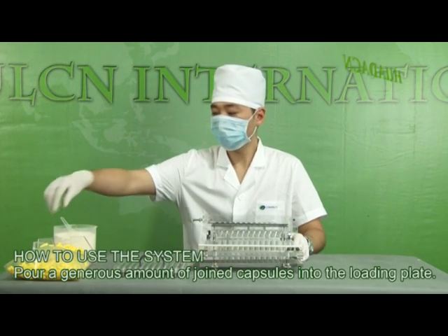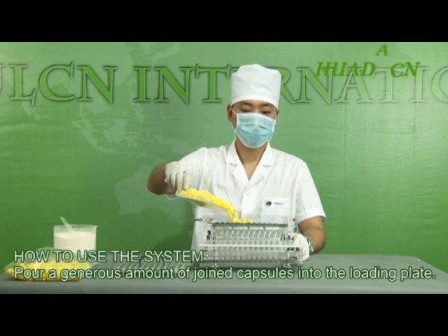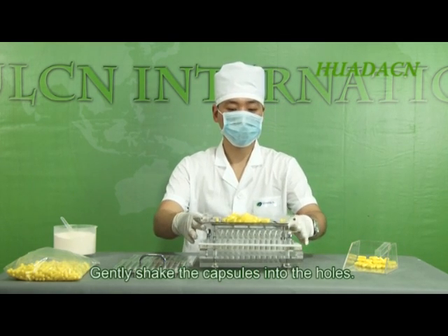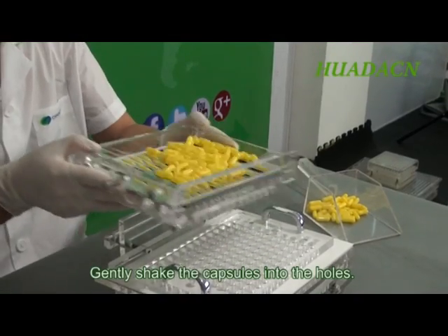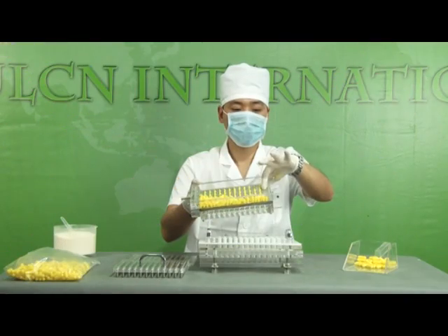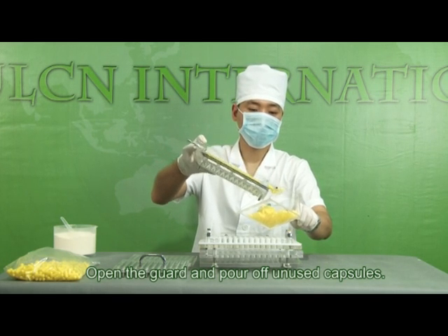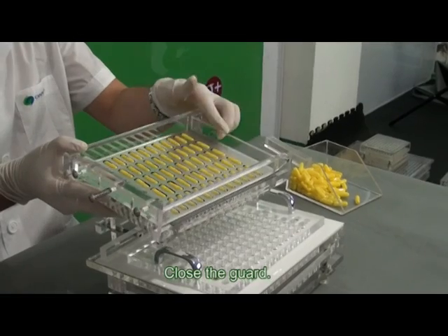Pour a generous amount of joined capsules into the loading plate. Gently shake the capsules into the holes. Open the guard and pour off unused capsules. Close the guard.